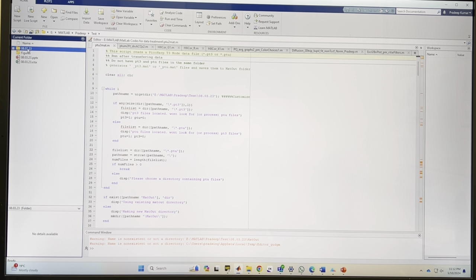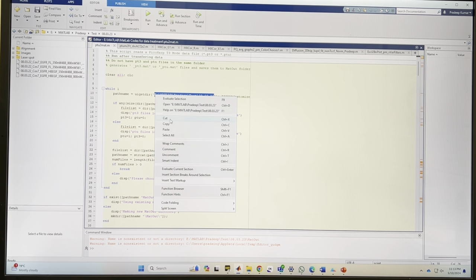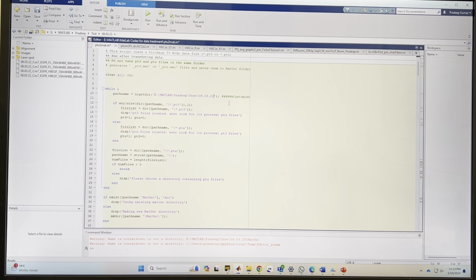First we have to treat the data. These are the 4 readings I took just for the experiment. Two are for EGFR before ligand activation, and two readings are after EGFR ligand activation. So we have only 4 readings. What I have to do here is get the path. You can see this is the path name, or if you have a new file, you go here, copy this one, and then paste it here. So you have now opened this one, and you should be in that folder.